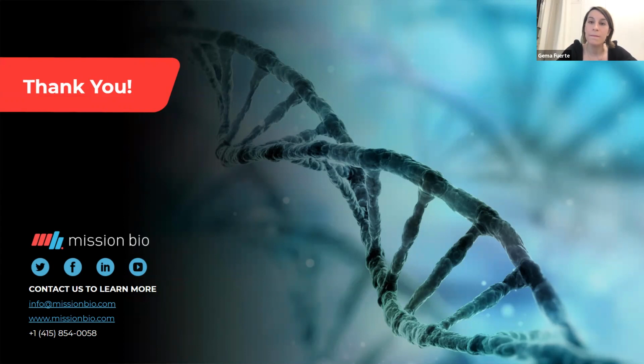Yeah. Great. Also would encourage you, we have example data sets. So when you download Tapestry Insights 3.0, it comes with a data set, which is from our 45-plex on PBMCs. So I encourage you to play around there, as well as with the Mosaic Jupyter notebooks. There's an example data set as well that you can explore. Great, that's great, because that was the next question.